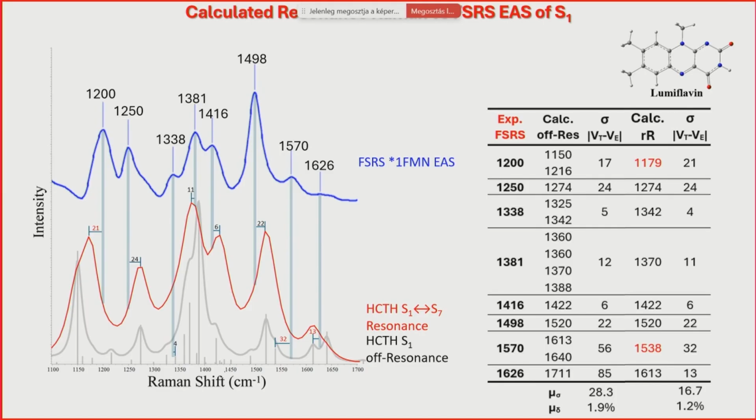An advantage of the resonance Raman calculations is that you can associate single peaks now instead of all the peaks in the region. You see intense bands and non-intense, and you can pick exactly which one to associate with the experimental spectrum. As a measure of the improvement, you can also subtract these two values.